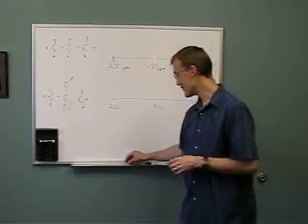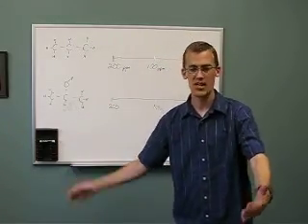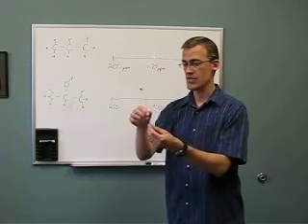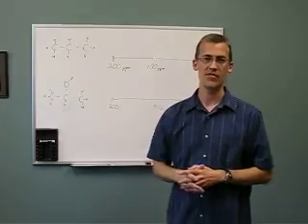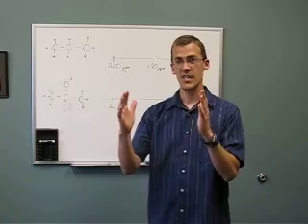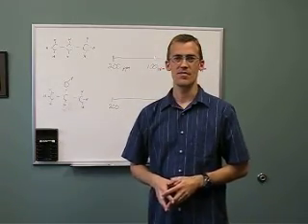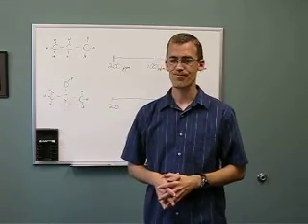So in our experiment, you're going to have a sample in one of these tubes. It's going to go into what looks like a big box, but trust us, inside this big box is a very powerful magnet. And all of the nuclei that were somewhat randomly spinning around are actually all going to line up with the magnetic field. That is the way they want to orient inside an external magnetic field. And so this is what we call the ground state. This is the lowest energy. It is what it wants to do under these conditions. So all the nuclei are going to be lined up.